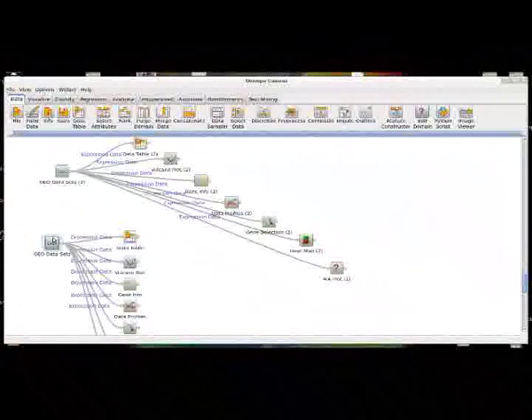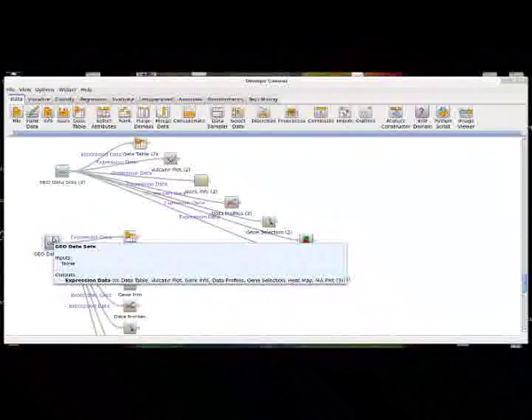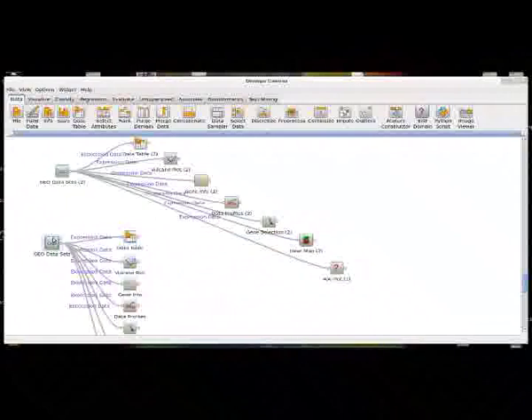We can see that we can download a wide array of different types of data with this GeoDataSets widget. And if you've ever played with bioinformatics data before, one of the biggest problems is data parsing. Science labs all across America and the world have a lot of different standards and formats that they like to put their files in, and it usually becomes a problem where anytime you get a data set, you have to go through and parse it in a way specific to that data file.